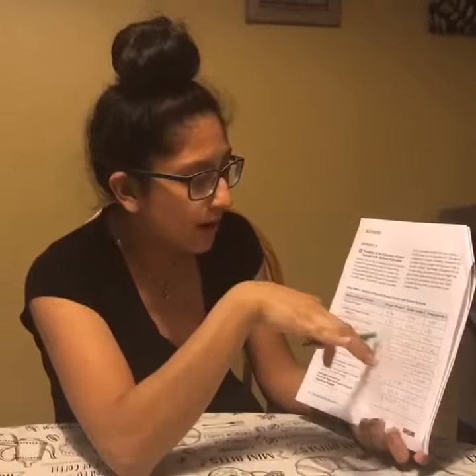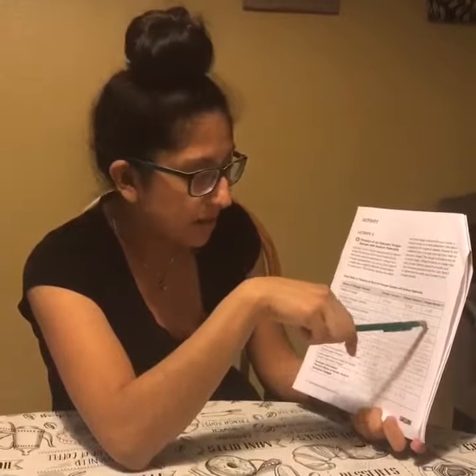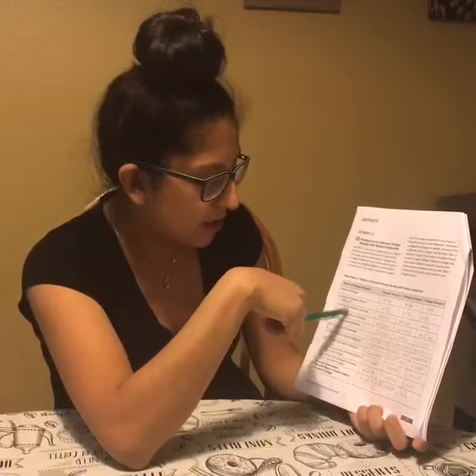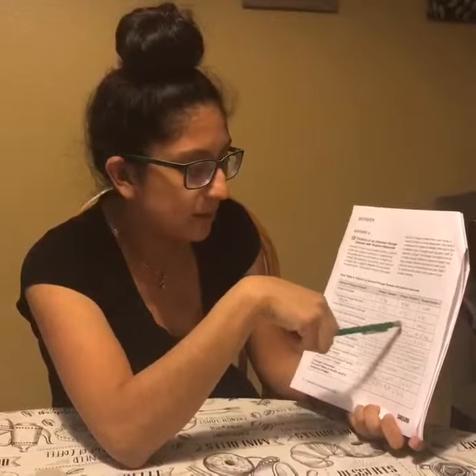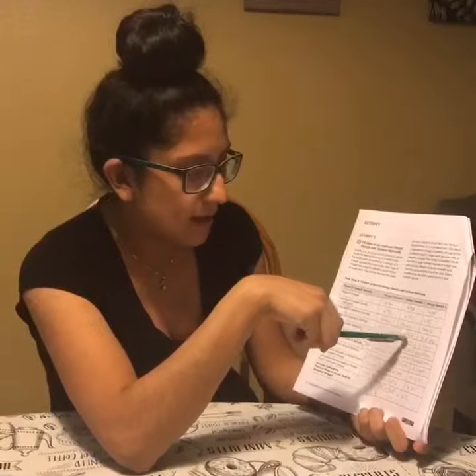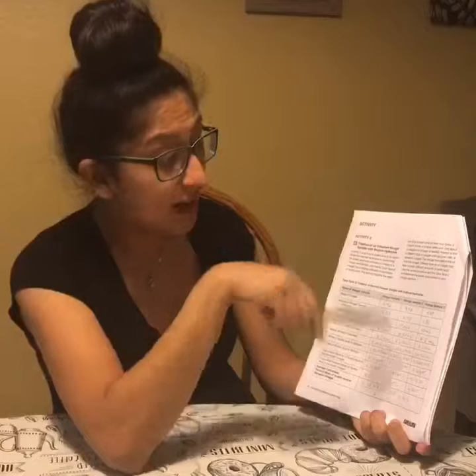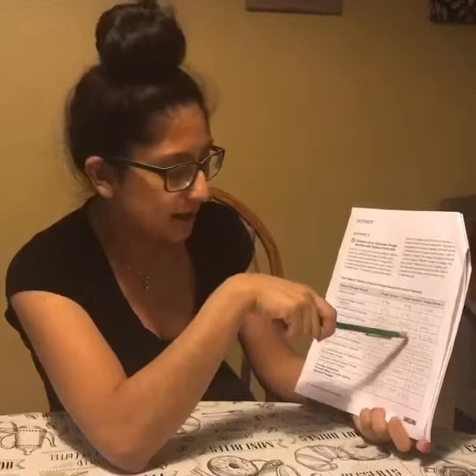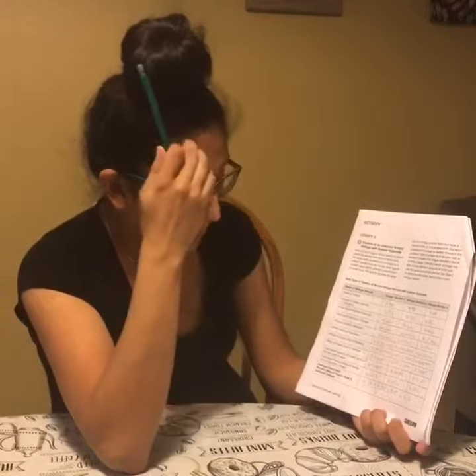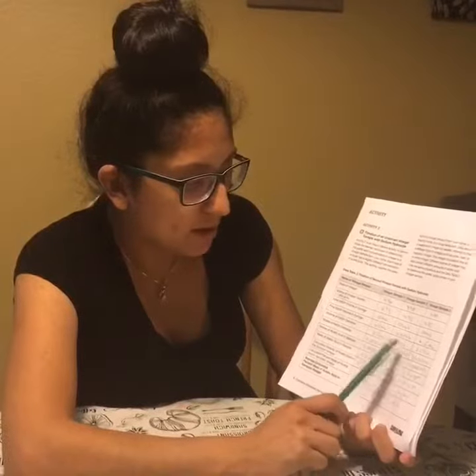Again, the numbers were around the same range. The volume of the vinegar density, pretty much the same, just a couple of different numbers. The initial volume, the same, which is 10 milliliters for each. The final volume, again, fairly close, there was not much of a difference like I had in data table number 1. The volume delivered, same, fairly close. 2 of them had the same numbers.